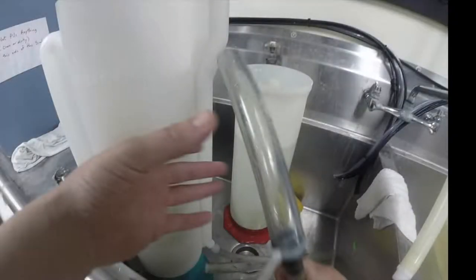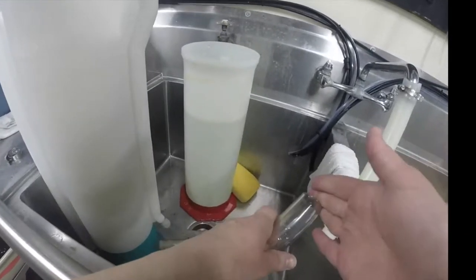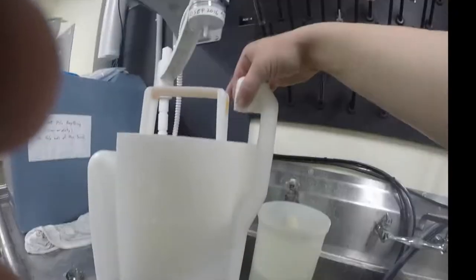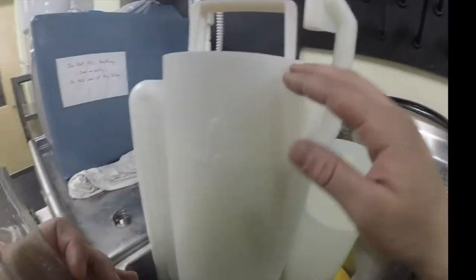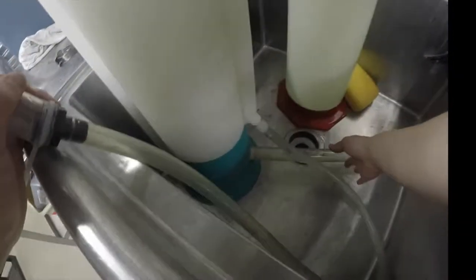So this guy right here, I'm going to connect this to the sink. And that's where water comes in. So water will come in to this branch, this leg right here. It'll come in and come out of the top and submerge the pipettes in water. And once it's submerged, it'll reach a point where it breaks, and then it'll drain. And it'll drain out of this big guy right here.